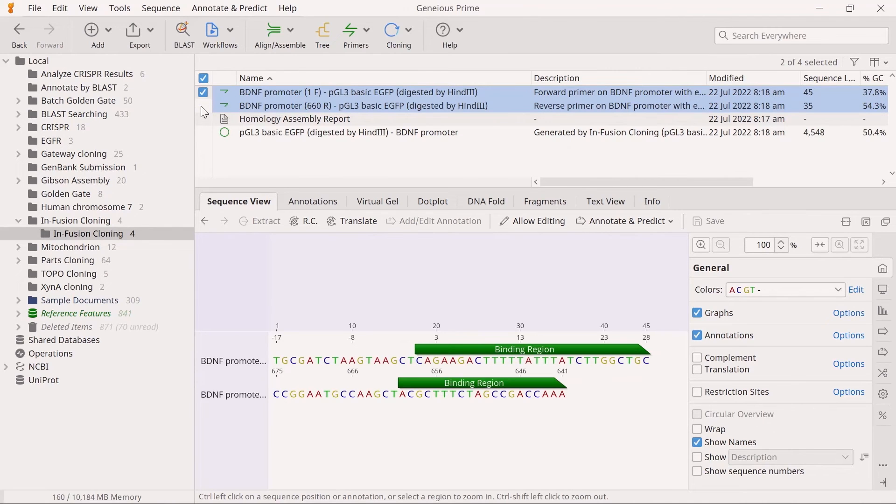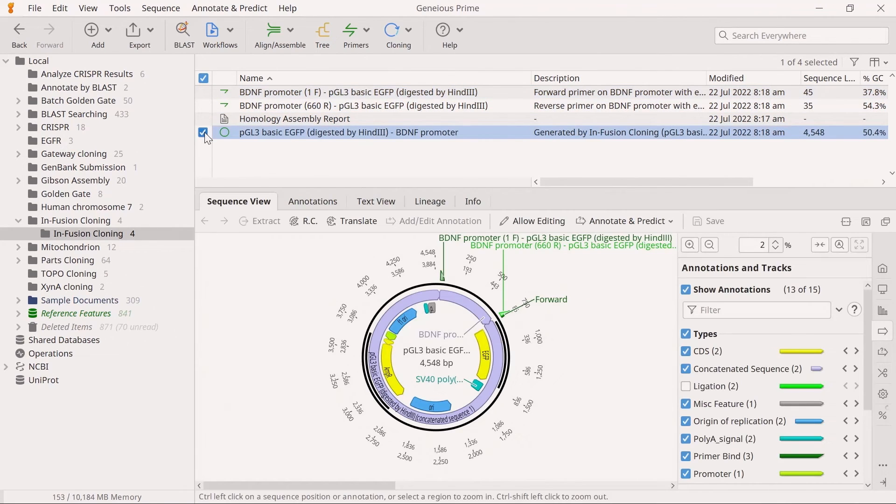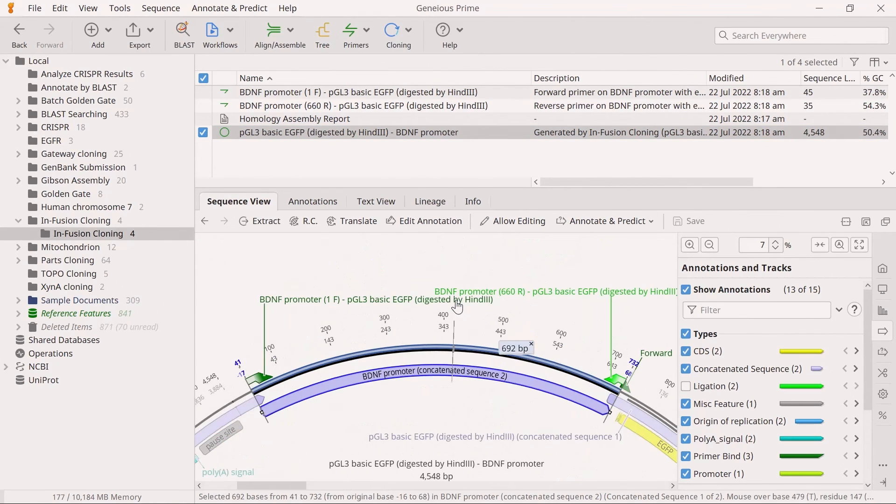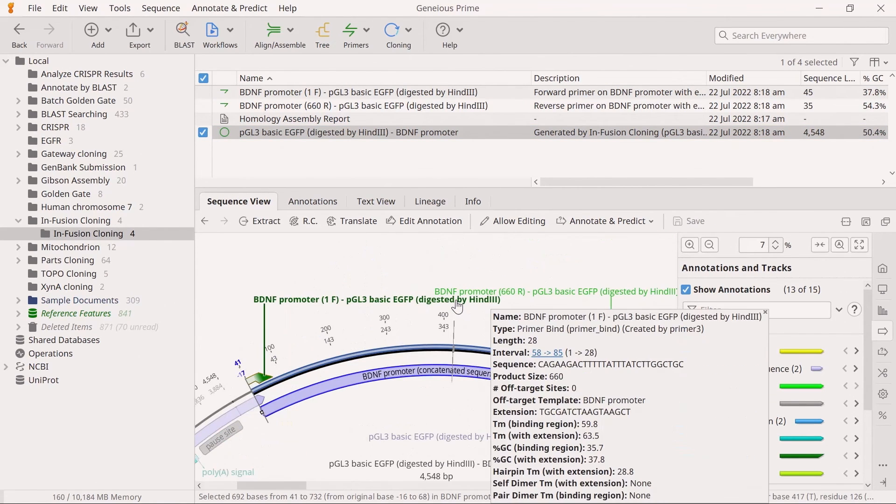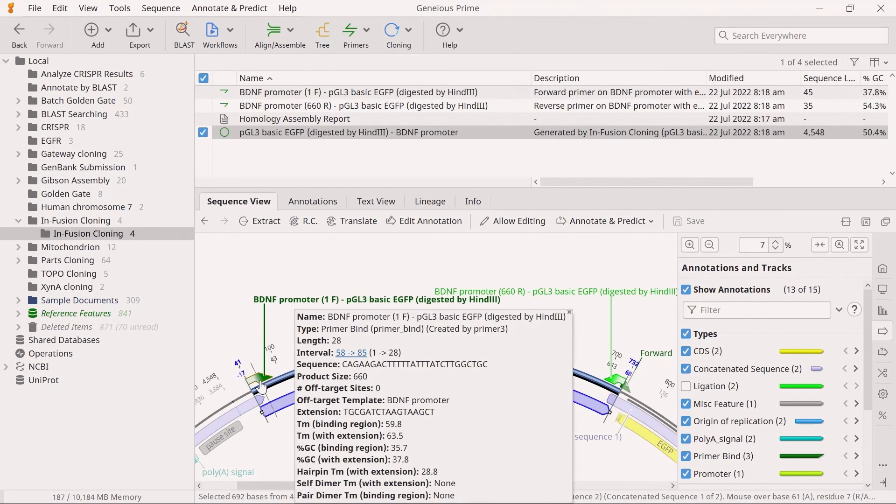Finally, you can preview the final plasmid by selecting the infusion cloning product. Here, you can zoom into the sequence to ensure the site's ligated sequences are as expected.